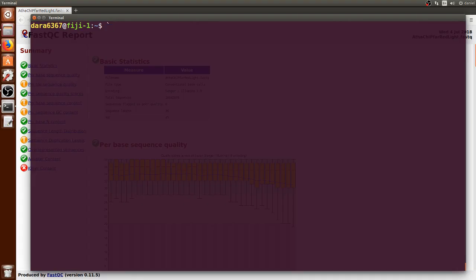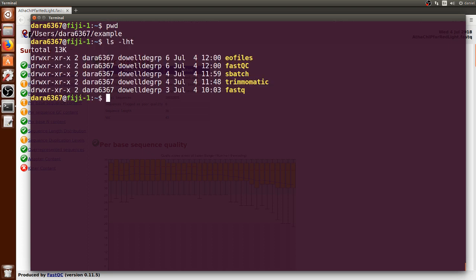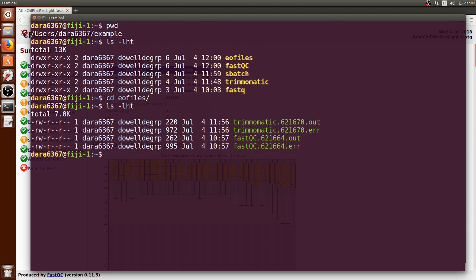It's been now a couple of minutes since the job finished running. Let's see what were the output files. We can print the working directory and list and navigate to the error and output files directory.